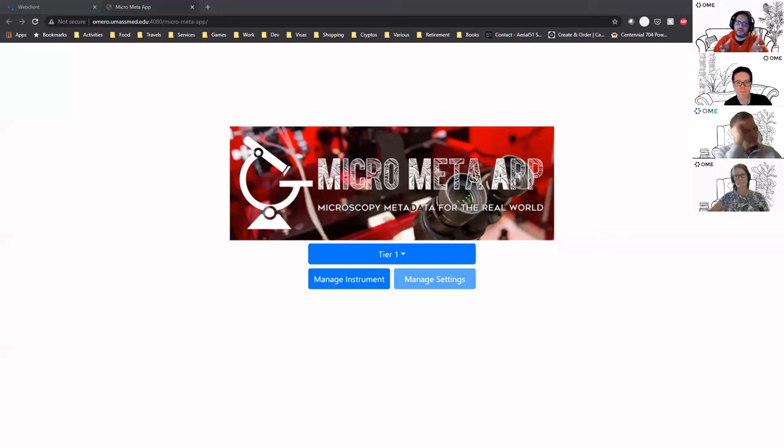And the first step will be creating more different kinds of microscopes, because we're still missing the advanced and confocal part of the model. I mean, the model is there, but we're missing the integration of the model in the app, because it requires a little bit of fine tuning.